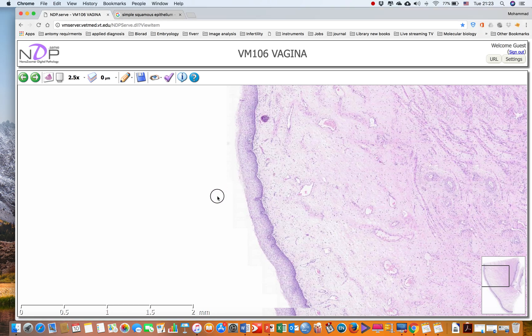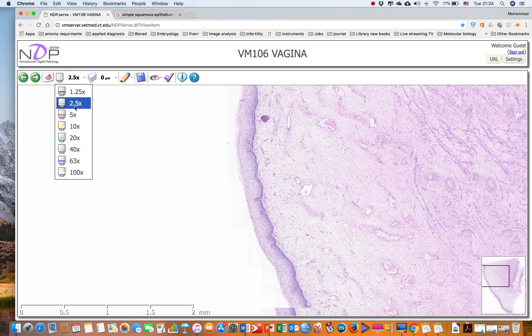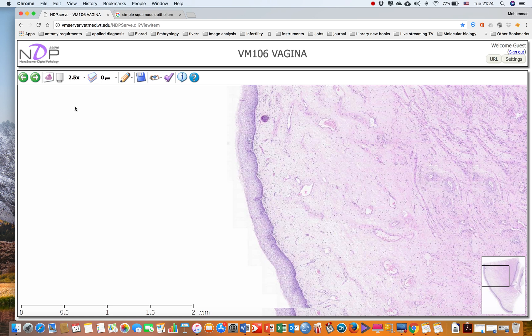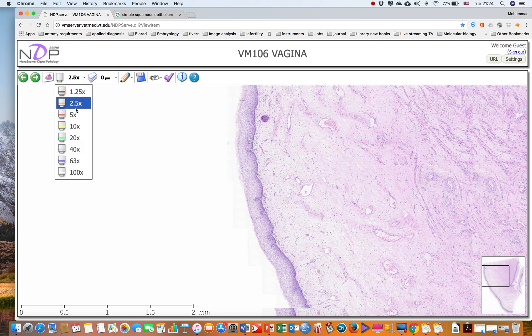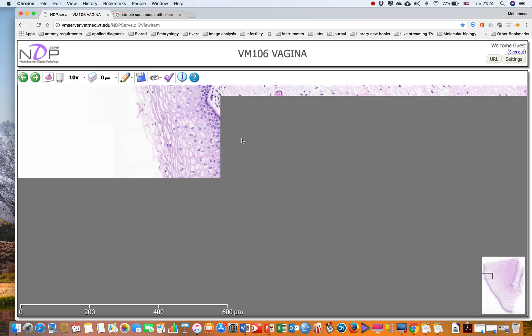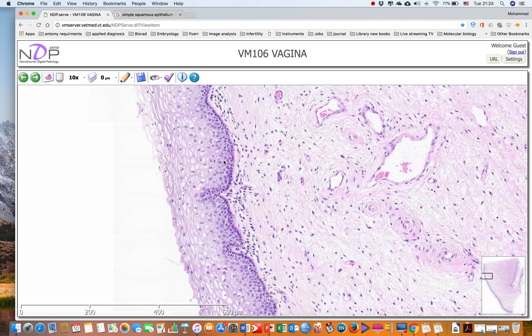On the side of the vagina, we are looking for the non-keratinized stratified squamous epithelium. As we said, the keratinized stratified squamous epithelium is found in the skin, but for the non-keratinized, the best example is the vagina. So if we increase the magnification, we start to see the epithelium.